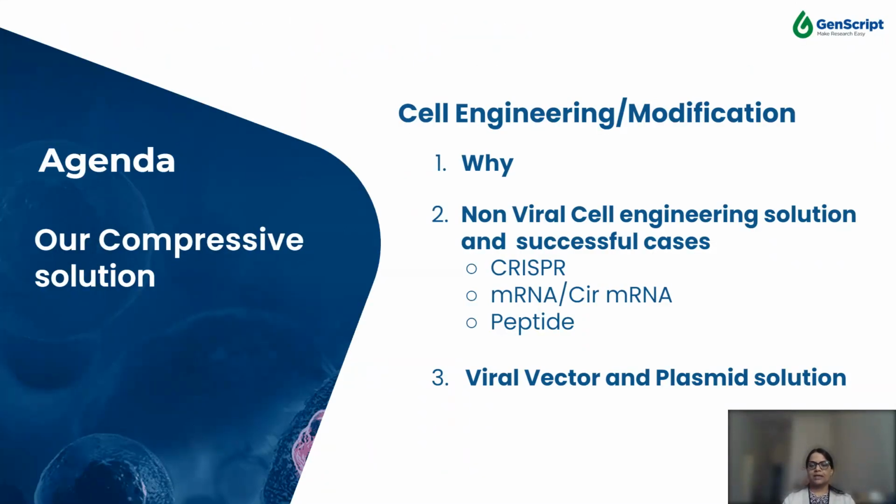So in cell therapy, after cell isolation, activation, and expansion, a very important step is cell engineering or modification. The effectiveness and safety of CAR T cell therapy can be improved by using engineering strategies, where genetic material is delivered to the cell through a vector, which can be either viral or non-viral. Each type of vector offers a distinct method of introducing genetic material into the cell. Choosing a viral or non-viral delivery strategy is an important step in the therapeutic design process.